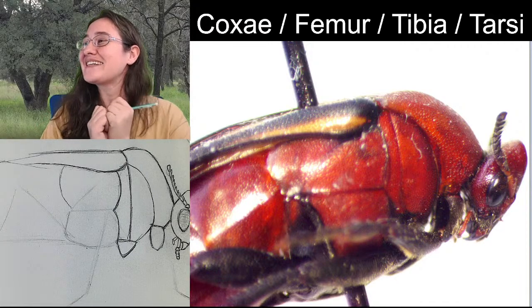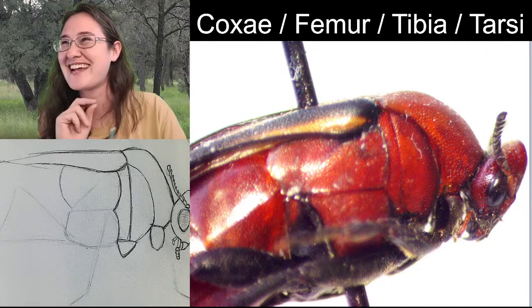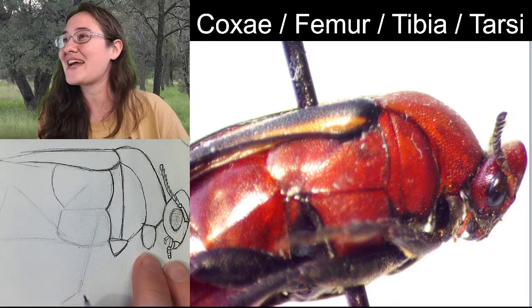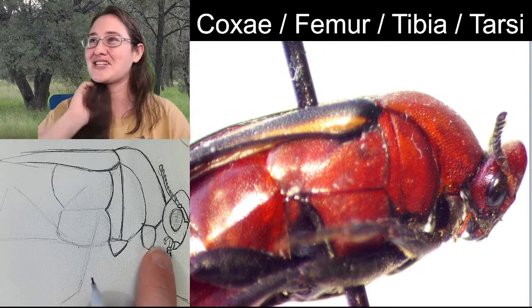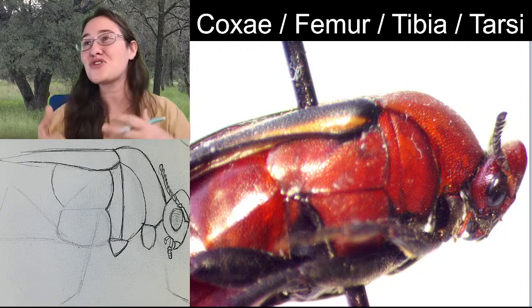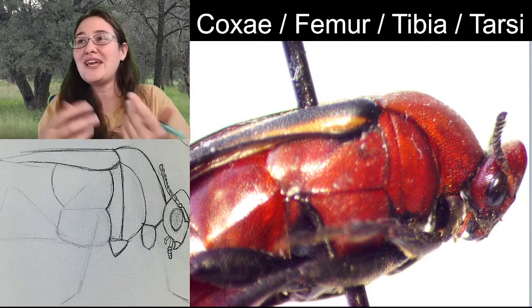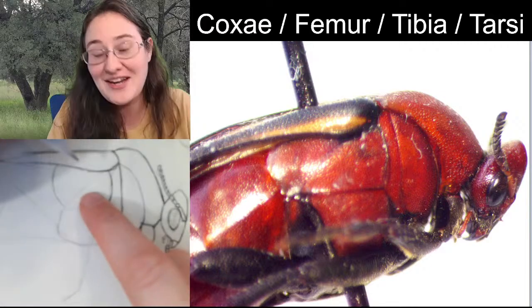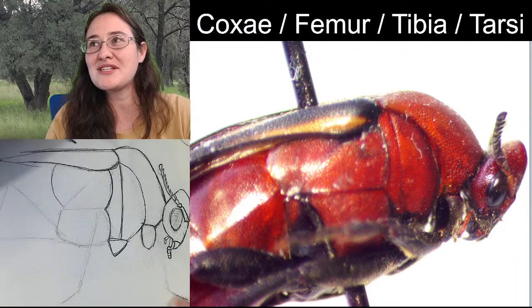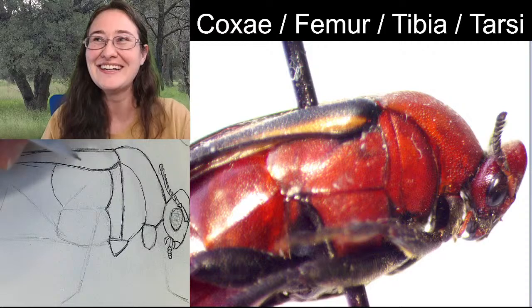Yeah, technically the coxa is connected to the trochanter. The trochanter is connected to the femur. We just didn't sketch the connection between the coxae and the femur because the trochanter is generally so small that we can't see it. We are going to look for it and see if we can find it, though. It does exist on, I would say, most insects. I probably can't guarantee you that every insect has a trochanter.